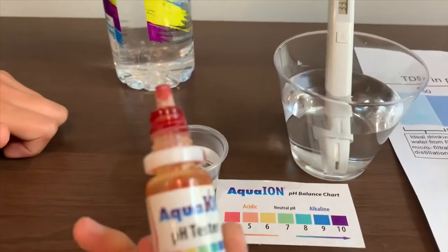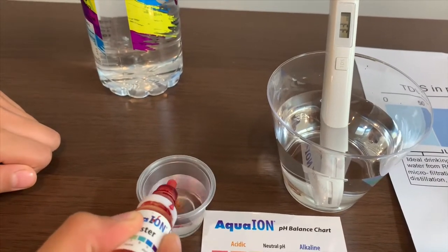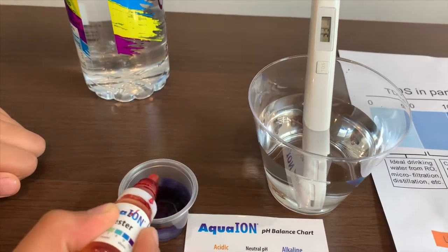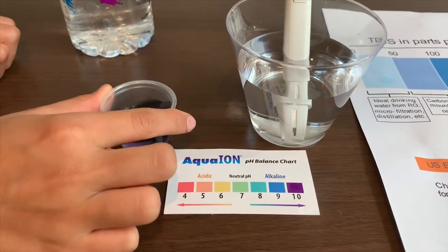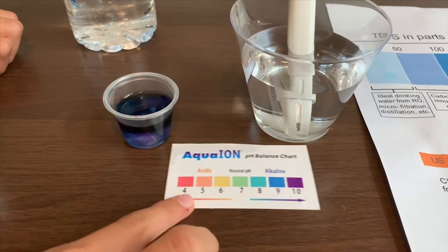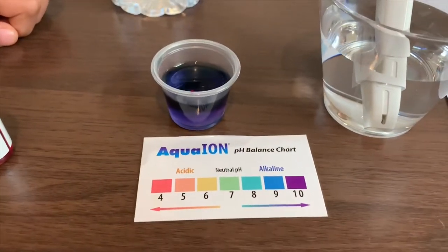Now let's test the pH level. 2 drops. That is close to the next. I give it a 9.5.